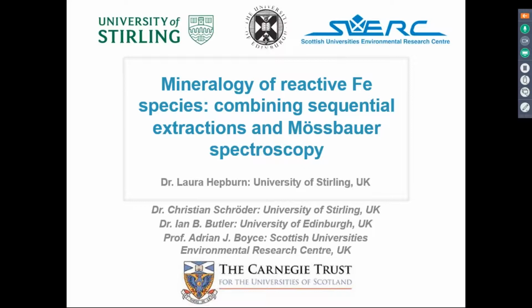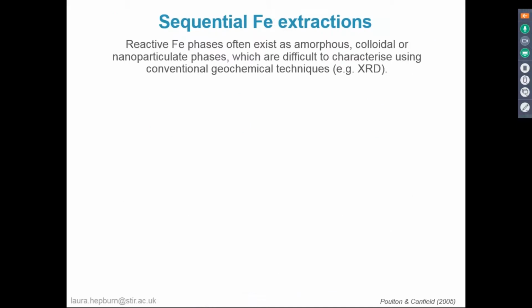And together we have been working towards the development of a method that combines conventional sequential extraction procedures with Mössbauer spectroscopy to quantitatively characterize reactive iron mineral phases. The reason why we are interested in reactive iron in particular is because it's these phases that are bioavailable within the environment.